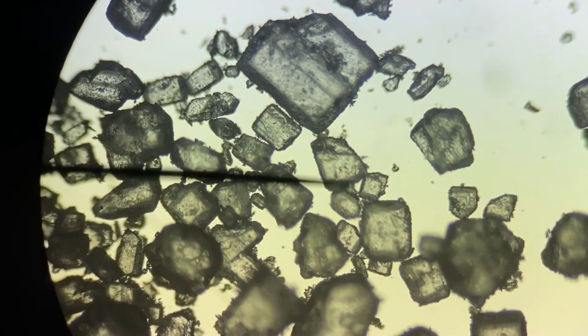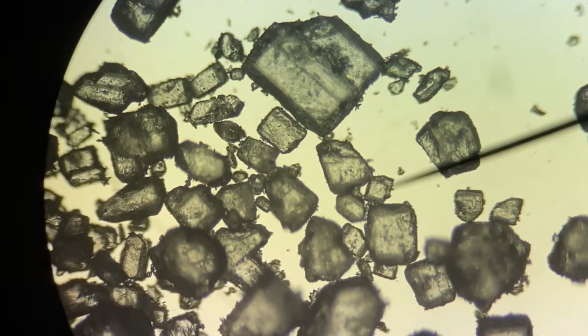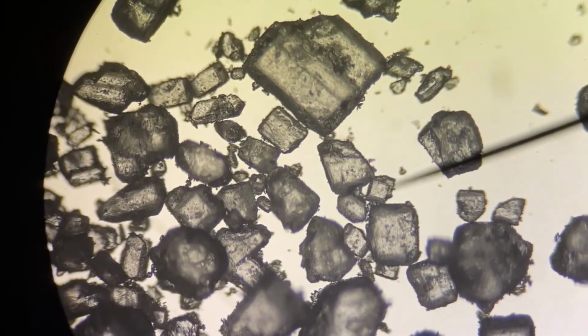Now that is really cool. What you're seeing is the sugar magnified to be 40 times the size than it actually is. What you can see here is we kind of lose that white appearance. It kind of looks gray, but what you're actually noticing is it's translucent, it's transparent.